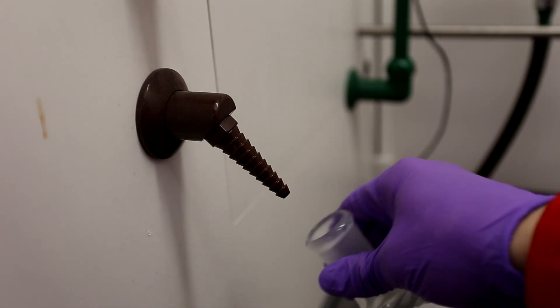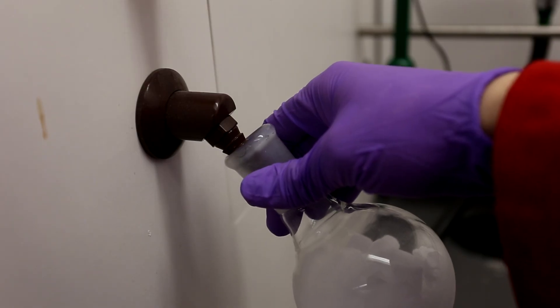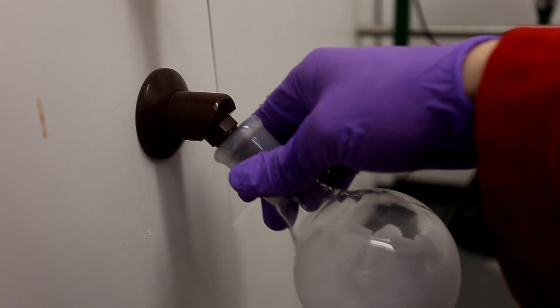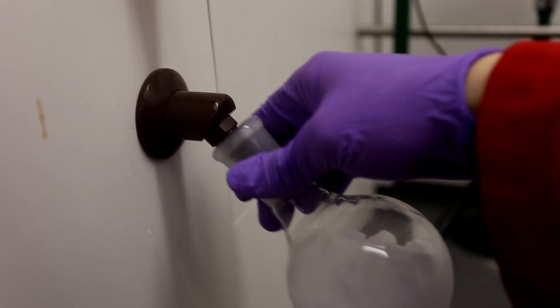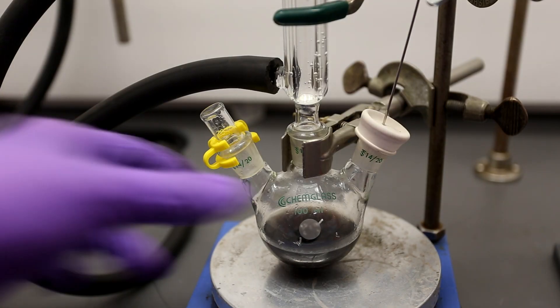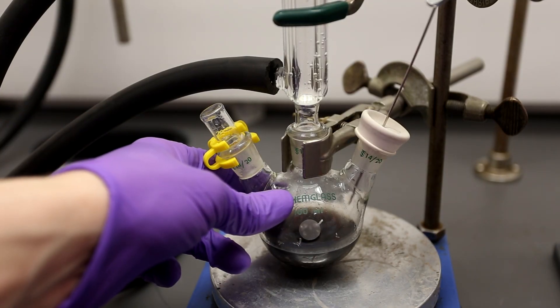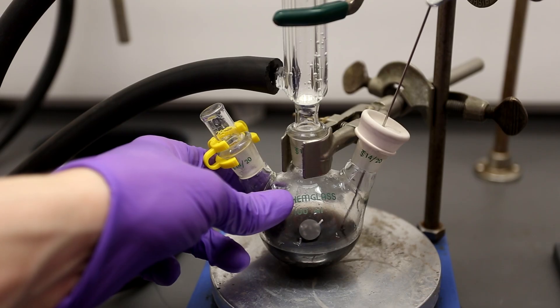Because this Grignard reagent is very sensitive to moisture, just for good measure, I flushed the flask with nitrogen as well as the feeding tube. The needle was then placed into the solution with strong stirring, and CO2 was fed in.